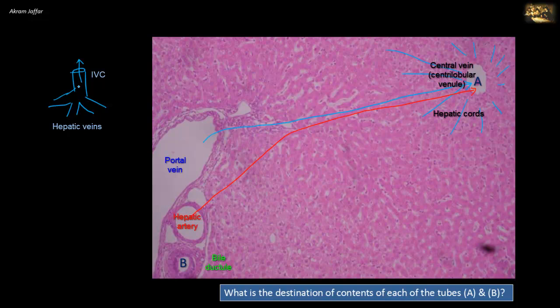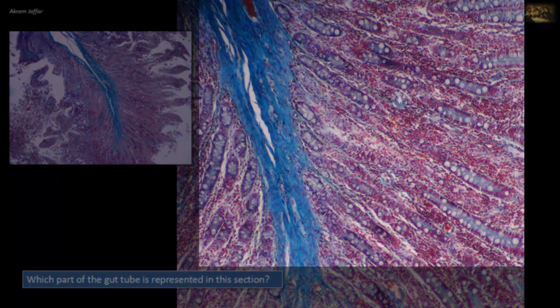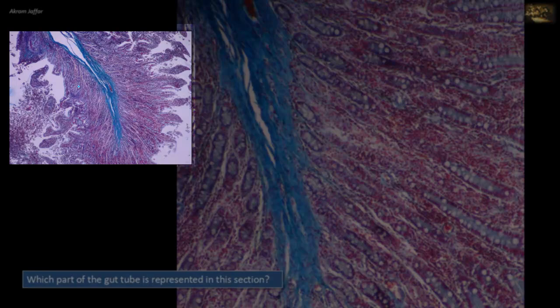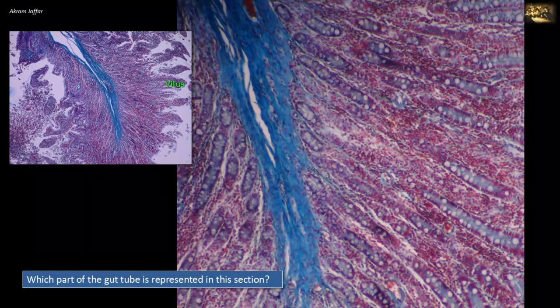The contents of the bile duct are therefore destined for the extrahepatic biliary passages, going to the duodenum. Which part of the gut tube is represented in this section? In the higher magnification photomicrograph on the right, note that the epithelial lining of the mucosa is a simple columnar epithelium with goblet cells, characterized by their almost empty cytoplasm and goblet shape — their mucus content is washed out during tissue preparation. In the lower magnification, we can see clearly the finger-like projections of the mucosa — the villi — the hallmark of the small intestine.